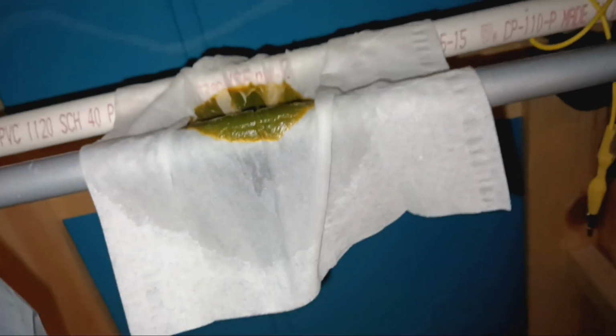I found that today. And the good thing is that you can see this is a very thick green material, which will, I don't want to touch that. I'm pretty sure I just touched the orange part, but... That means when it dries, it's going to basically be powder. And that's going to be good, because the powder is what we want.